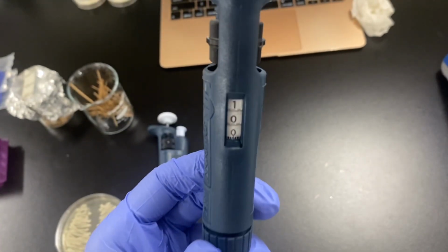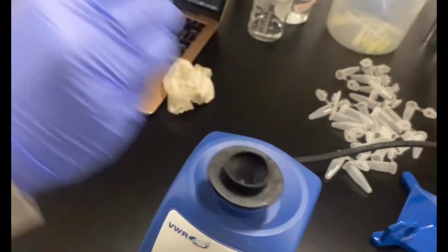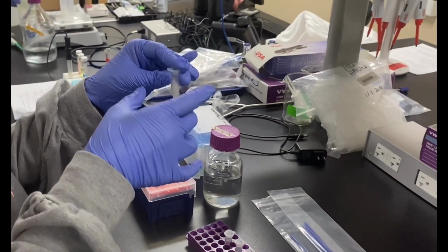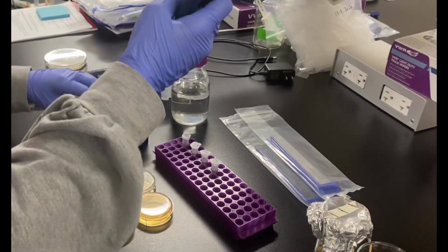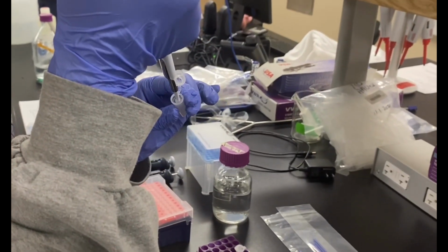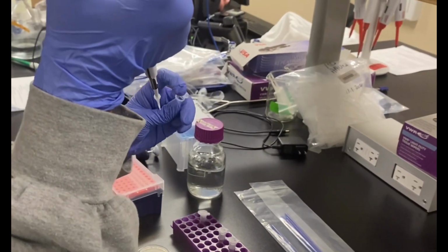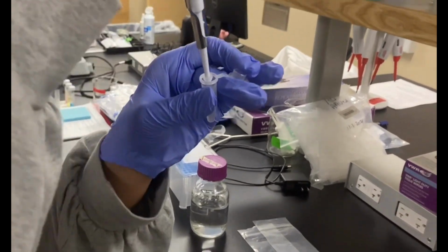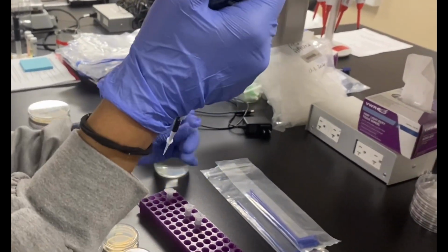Adjust the P20 micropipette to 100. This will allow you to get 10 microliters of solution. Attach a fresh pipette tip and add 10 microliters of the content in tube S0 or tube 1 into tube 2, containing 990 microliters of sterile water. Make sure you vortex before and after each transfer. Keep in mind, you may also mix the solution with a micropipette by using the plunger on the micropipette to mix the two solutions together.